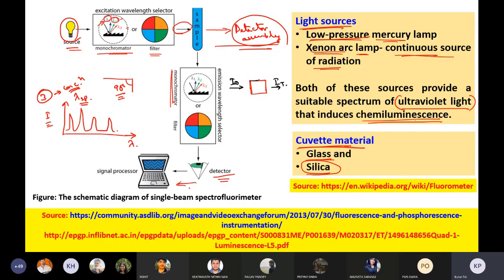So you will find the other two surfaces, this black, they are grounded, and hence they are opaque. However, these blue surfaces, they are the transparent surfaces. This is for the cuvette for UV visible spectrometer.